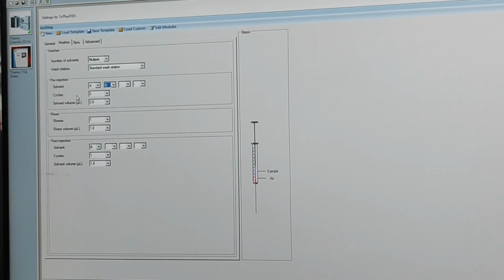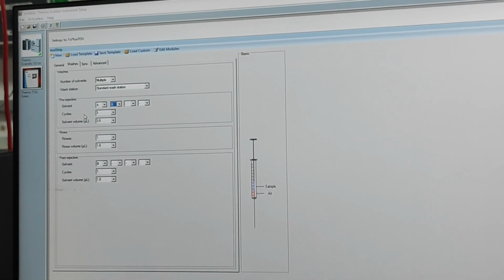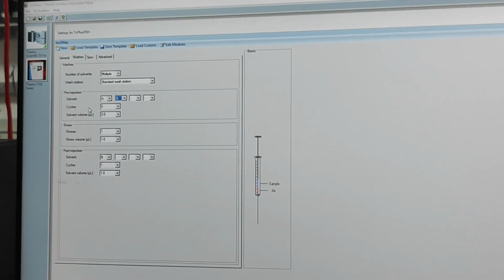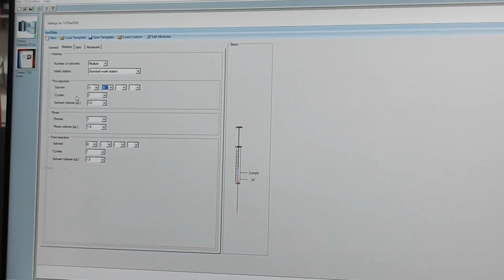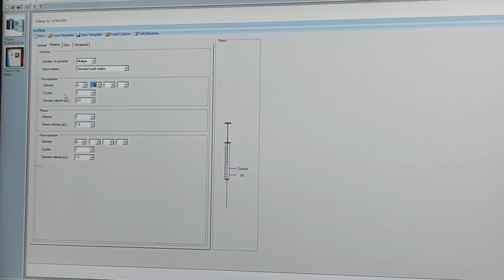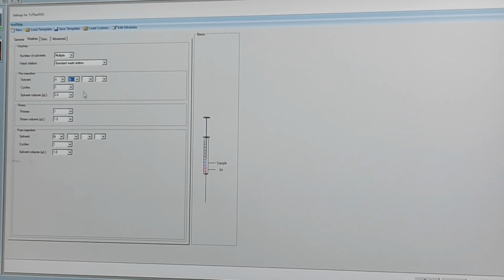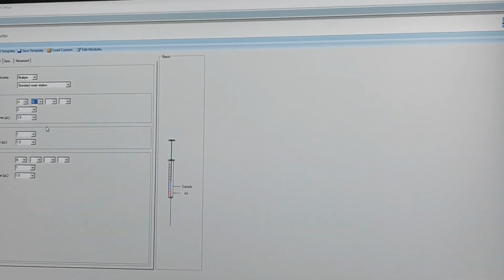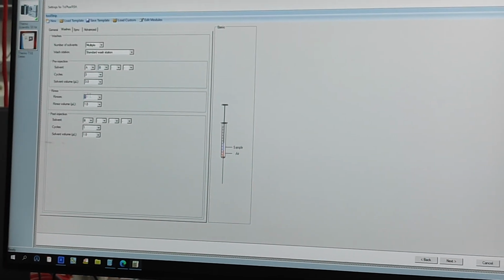Pre-injection will always be a cleaned syringe, because of the post-wash. Once the sample is injected, the post-wash happens, and that will clean it. Before the next sample, the pre-wash also will happen, because it is already a cleaned syringe. Again, it will be cleaned, rinsing before taking the sample. But the contamination level is very high in post-wash, because post-wash is after handling the sample. Clear? Now rinse with the sample.